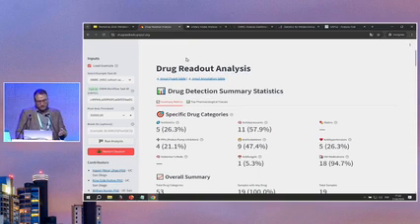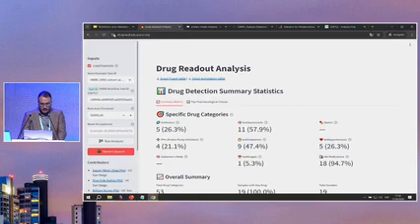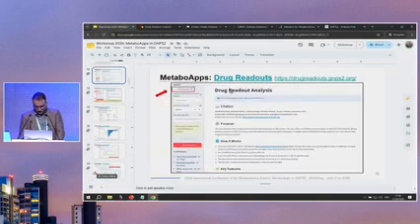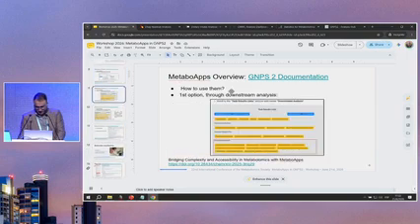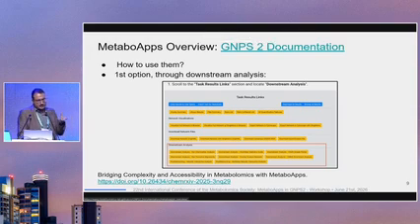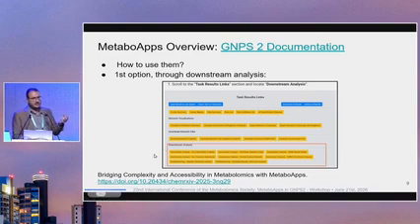And based on that, if I go back to this part of the presentation, to start this job you're going to select some information based on how similar, or how strict, you want the correlation to be based on the fragmentation of your spectra. That's one of many other parameters that you're going to select to run a GNPS job.